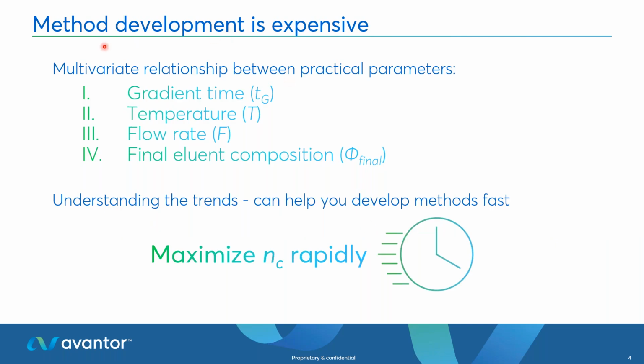I'm sure for all of the separation scientists and the chromatographers on the call today, you would have experienced in one form or another that this exercise of method development is very, very, very expensive. It exhausts a lot of our time, a lot of our consumables, and also it demands a lot of our expertise, especially when the samples become more complex.